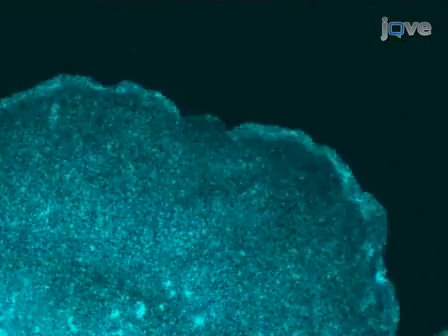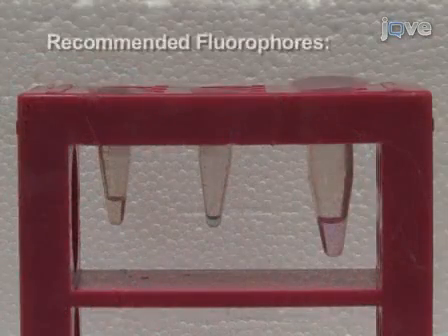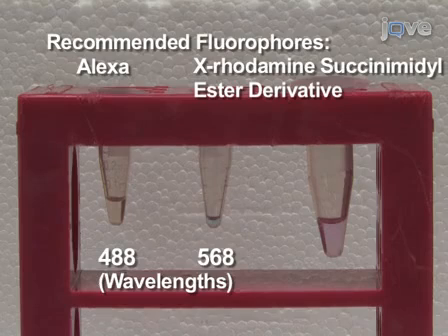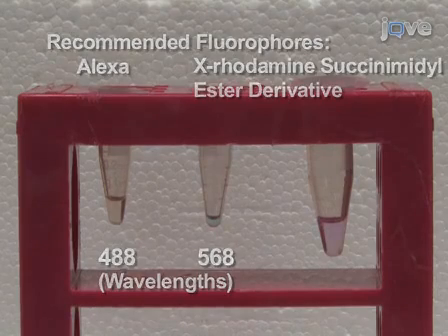A key component to acquiring good fluorescent speckle microscopy movies is the proper labeling of actin with the fluorophore of your choice. We recommend using fluorophores of Alexa and X-rhodamine succinimidyl ester derivatives that target exposed lysine residues on the surface of actin. It is important for the labeling ratio to be high, around 0.3 to 0.7 dyes per monomer of actin, to ensure that speckles will appear bright and discrete.